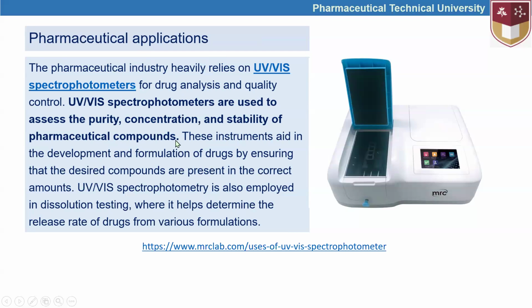Again, some molecules have their own UV absorption spectrum, and the pure compound has its own spectrum. If we identify the UV spectrum of the given samples, and it differs from the spectrum of the standard, we can make a conclusion about the impurity of those samples as well.